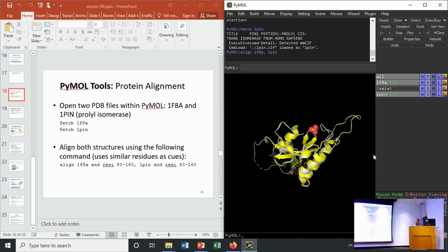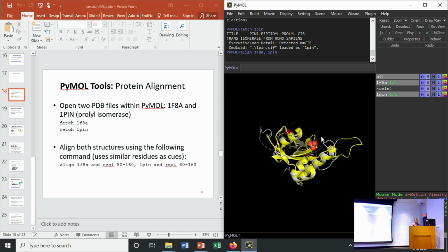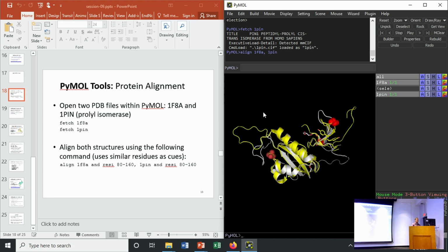And having worked on this protein, there was a big debate in the field whether this yellow loop was maybe some kind of gate that closed and opened over the active site and maybe controlled the function of this enzyme. And eventually, enough structures were determined and experiments were done, and people realized that this is basically a section of the protein that's actually interacting with the next crystallographic unit cell.